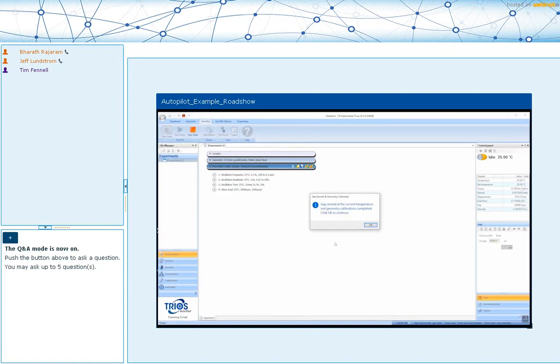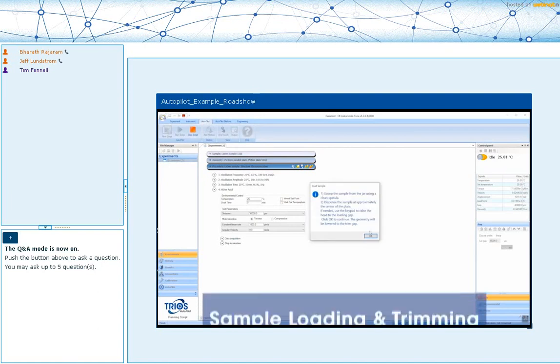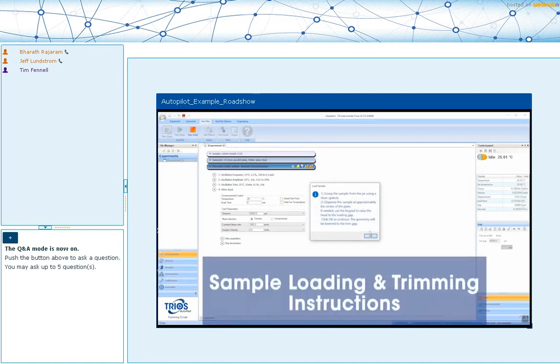Once they say OK, we ask them for the test temperature. The instrument then waits to get to that temperature, which is 25 degrees in this condition. And once it gets there, it's going to wait and soak at that test temperature for a few minutes. And this is important because you want to make sure that the geometry has equilibrated at the test temperature before you do any additional calibrations like a zero gap.